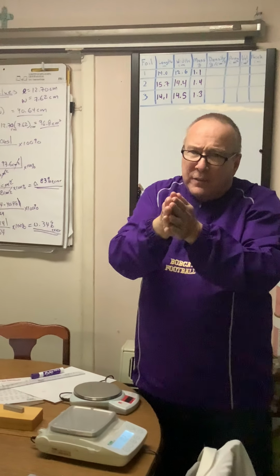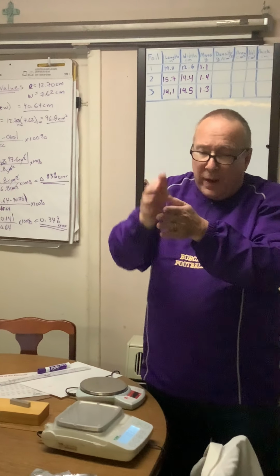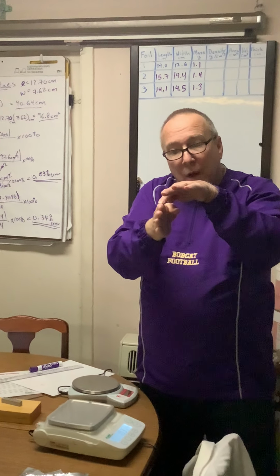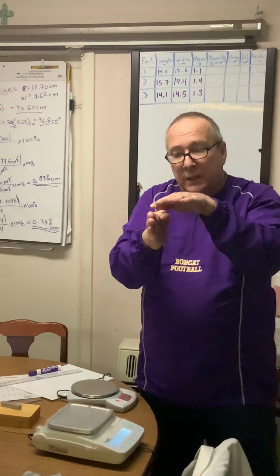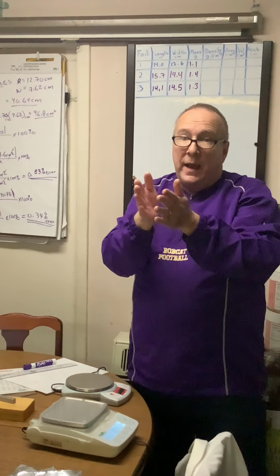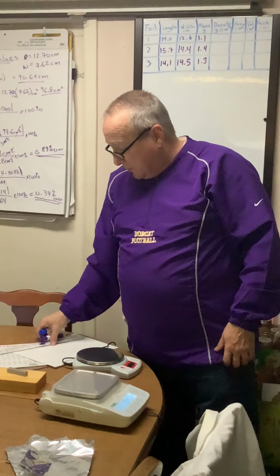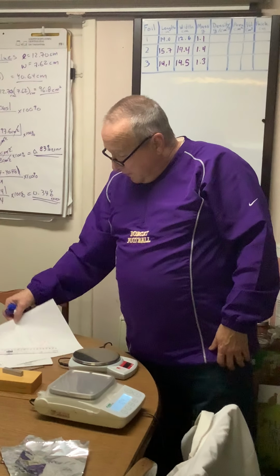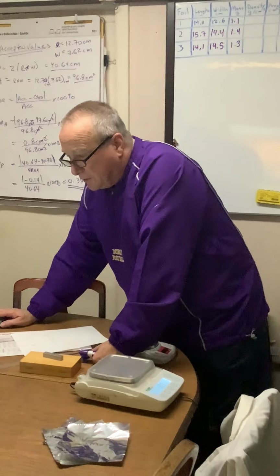It's because it has a knife edge, that piston that goes up to the weighing pan balances on, and as you put more pressure on it, more weight on it, weight is a force, as you put more force on it, then it deflects it, and that deflection is measured very accurately and related to the mass of what you're weighing. So let me now do the calculations and show you some of the things we need to do.